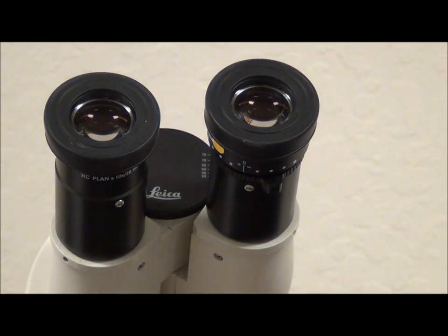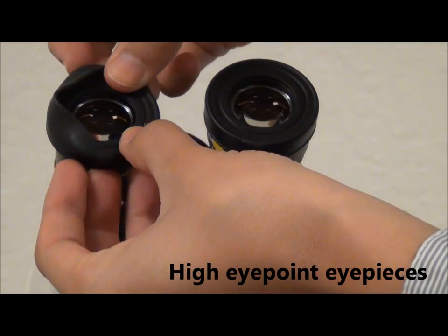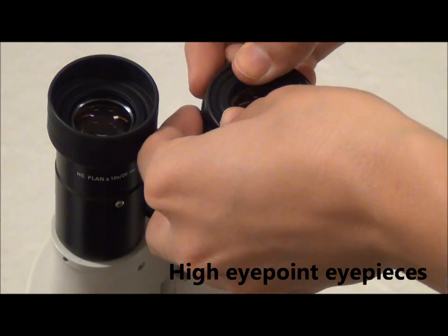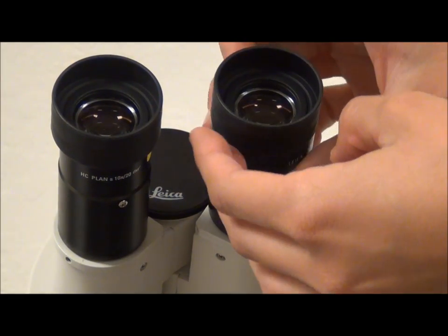Let's start from the top of the microscope down. These are high eye point eyepieces, specifically designed for users with glasses because they have a high eye point and rubber padding to cushion your eyes. If you don't use glasses, you may want to fold these down.